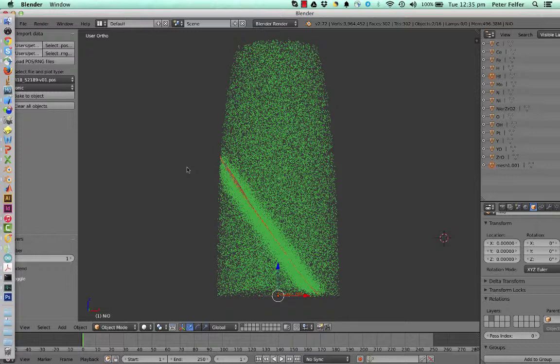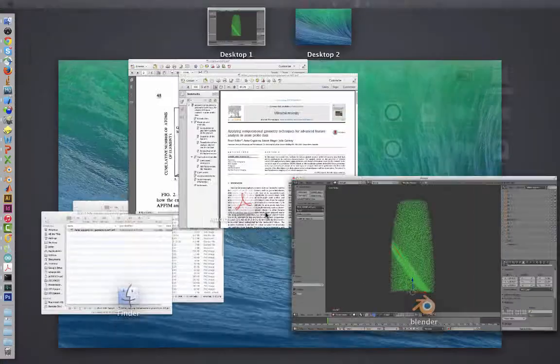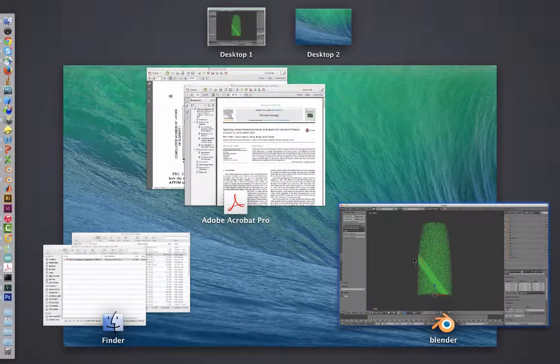Well, very often what you see people doing is using concentration profiles. But actually, in atom probe tomography, especially at interfaces, concentrations don't really have a solid meaning because of aberrations. That's why we're using the integral number of atoms per unit area that are there in excess, called the interfacial excess. And this is actually what quantifies the amount of segregation that you have, rather than the concentration.